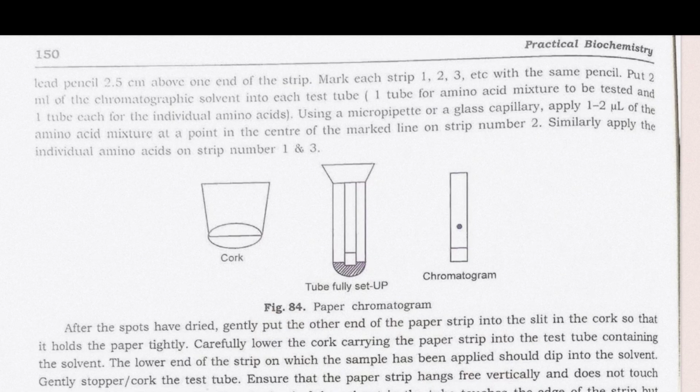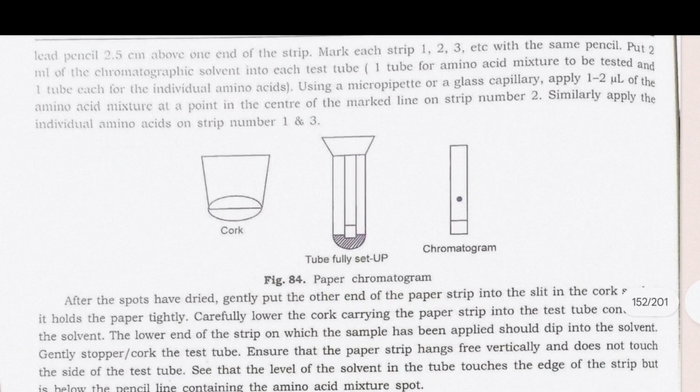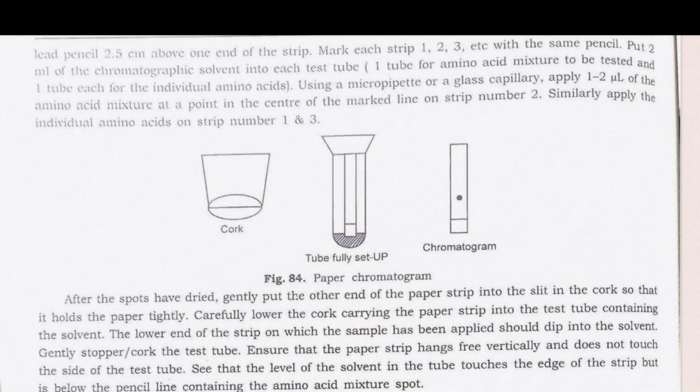Carefully lower the cork carrying the paper strip into the test tube containing the solvent. The lower end of the strip on which the sample has been applied should dip into the solvent. Gently stopper the test tube.